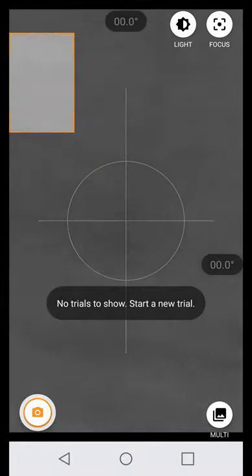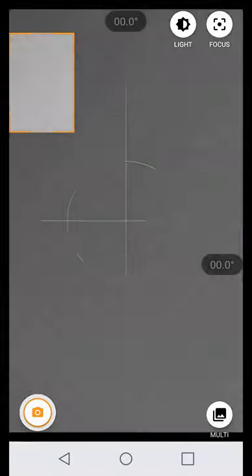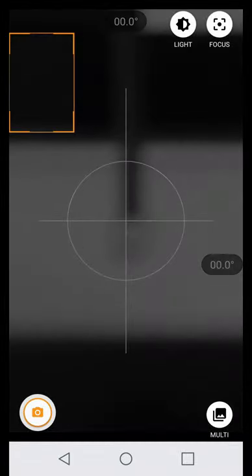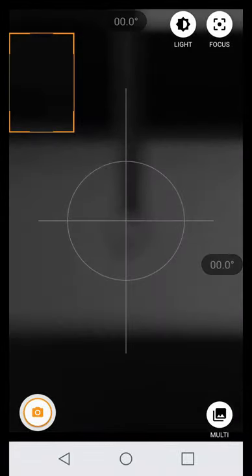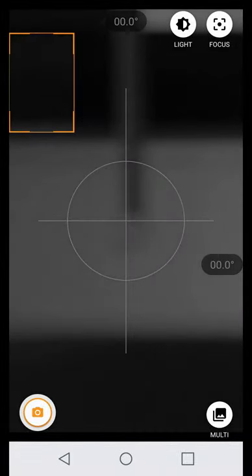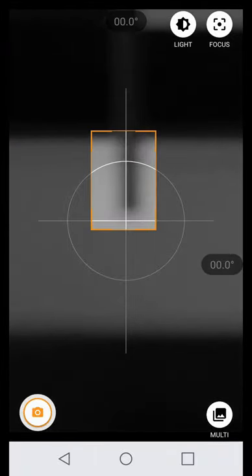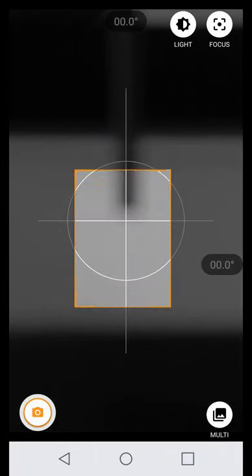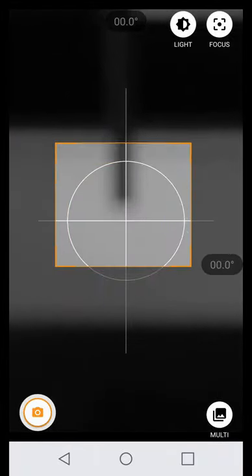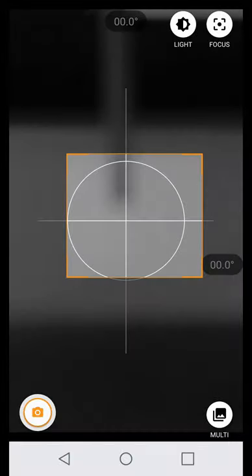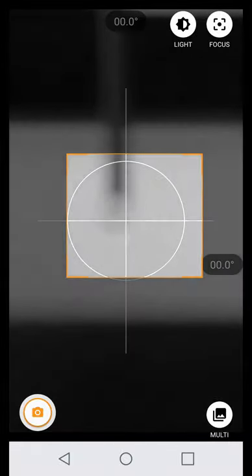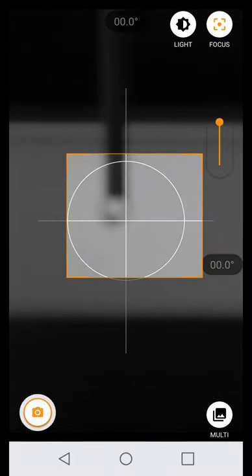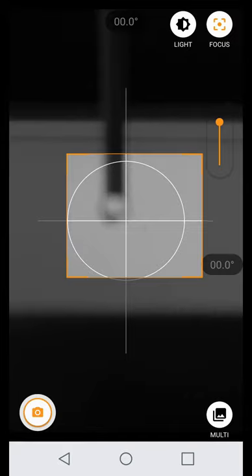We now put the phone inside the holder and adjust the distance from the needle. We manipulate the orange box to select the area of interest. Before adjusting the focus on the image, generate a droplet to give a reference frame.